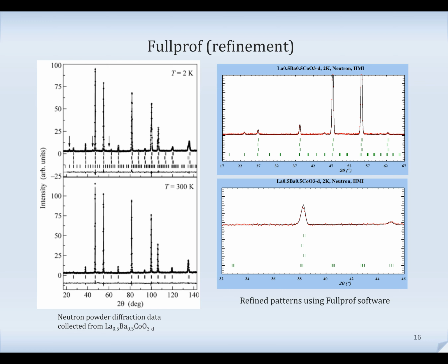Okay. In this case, the resolution of neutron diffraction is less? Yes, usually it's less. You cannot reach with neutron diffraction, at any instruments around the world, the same resolution you can get using synchrotron radiation, even for so-called special instruments like E9, the fine resolution powder diffractometer.